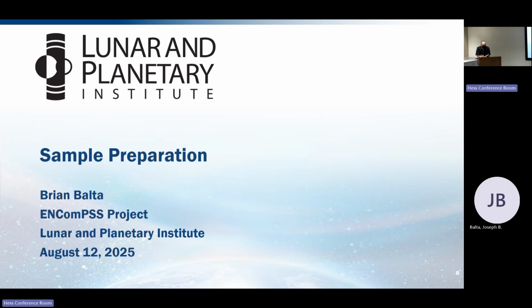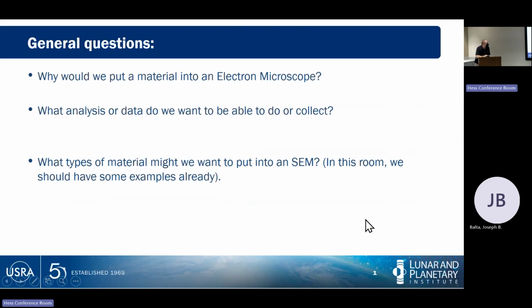We have at least one weird sample person in here, which means that you're also going to get to see me try to figure out a challenge because I've never done some of the stuff that she wants to work with either. But that doesn't mean it's impossible. It's going to be interesting to try to figure that out following some general guidelines.